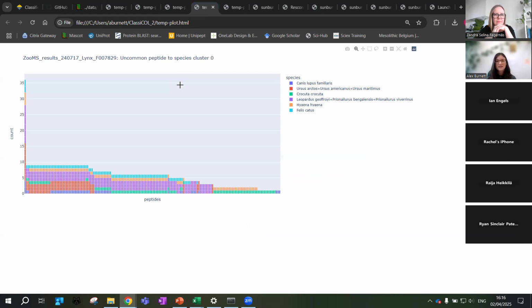This is that bar plot. It is a bit confusing to look at first, but what we have here is a clustering of all of the species that are outcomes in that sunburst. And you can see how far these overlap. It's interactive, which is quite useful. So I can see off the bat, there's not that much uniqueness for Canis lupus.